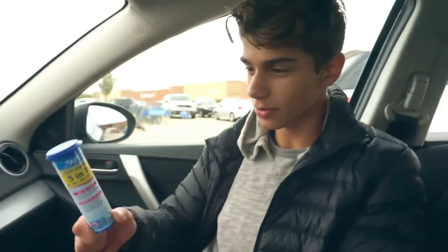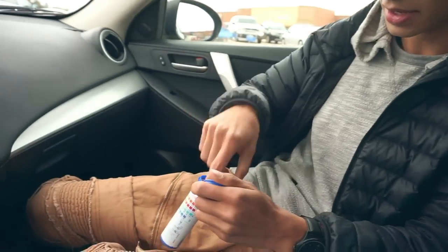Alright, guys, we have the test strips and I decided to take it outside because of the audio and stuff. Here's the tube, and inside of here are little test strips. On these strips, you can test the pH, the nitrate, the nitrite, the KH, and the GH.